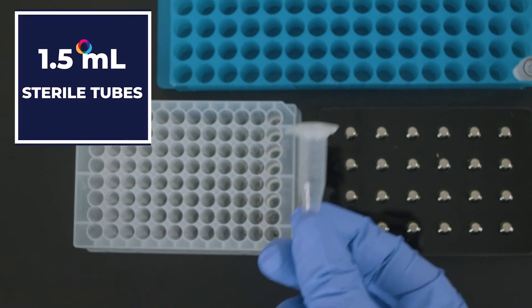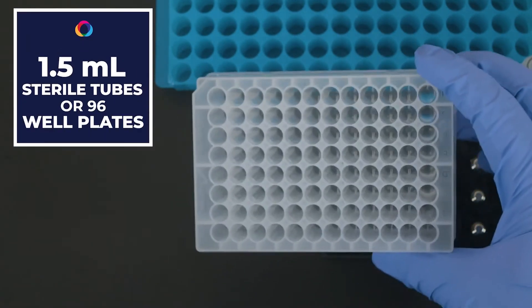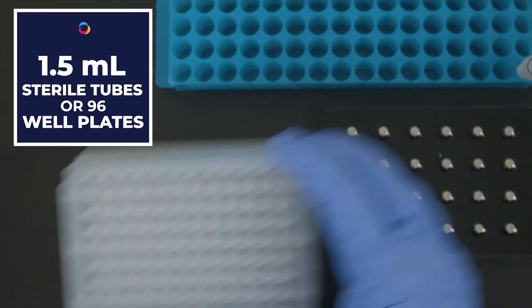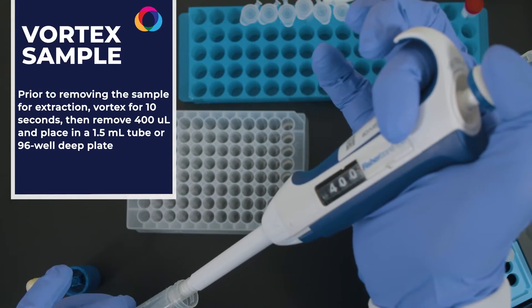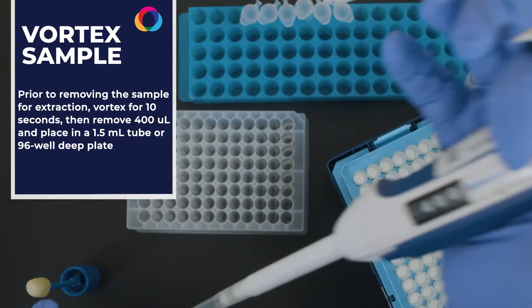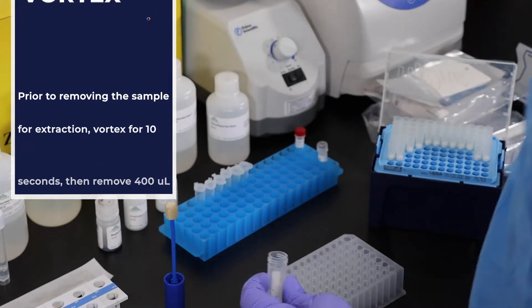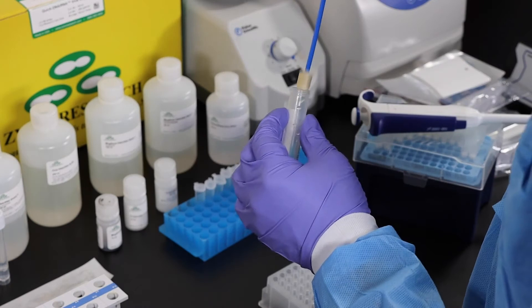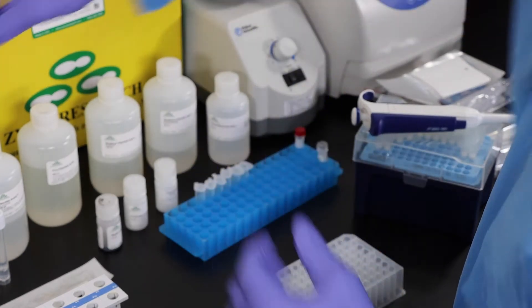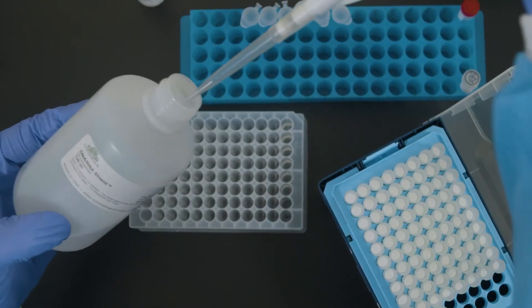The extraction may be performed in 1.5 mL sterile tubes or sterile 96-well plates depending on the number of samples requiring extraction. Carefully pipette 400 microliters of the vortexed sample to a designated well on the plate or 1.5 mL tube. To prepare the NTC or no template control, pipette 400 microliters of 1x DNA RNA shield to a new tube or designated well on the plate.